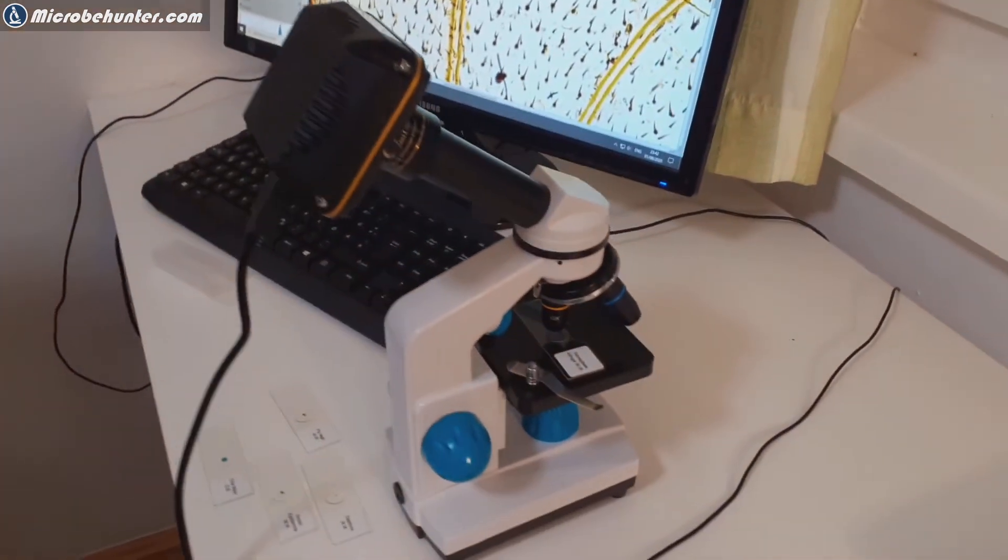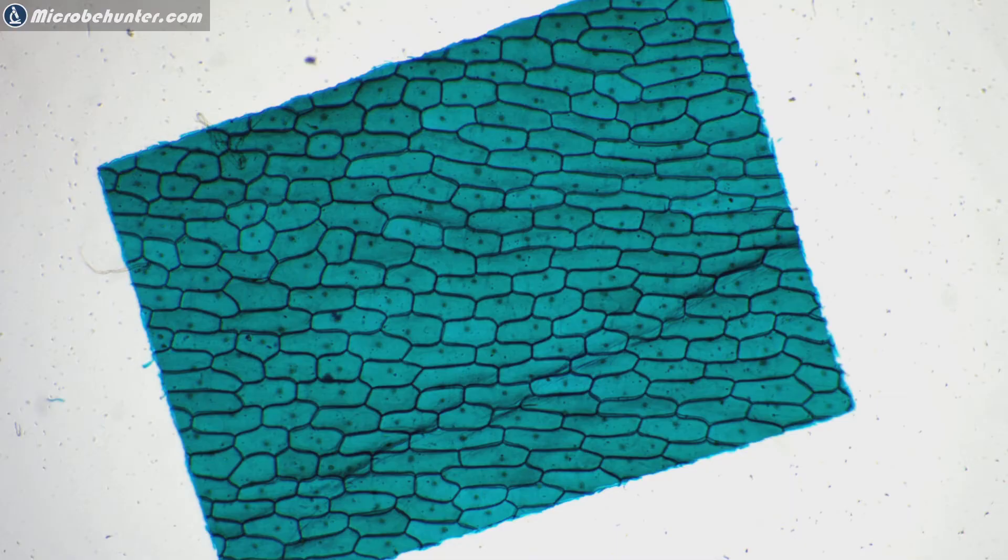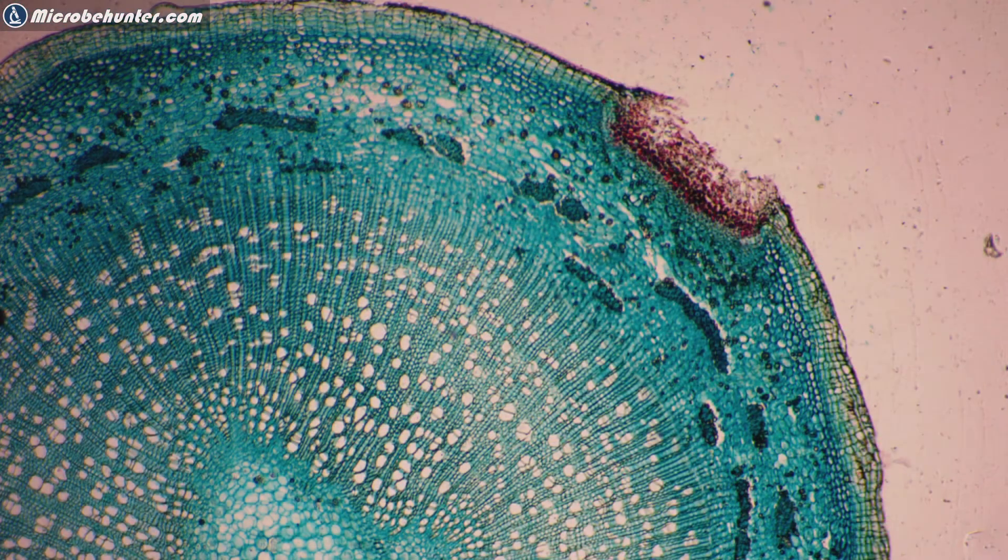This of course allows you also to do live microscopy without having to look through the microscope itself. So this now these are onion cells with a 4x objective. Again it is now with a 10x magnifying objective, the little dots that you see in the cells of course these are the nuclei. Cross-section of a stem of Tilia is called, the plant.